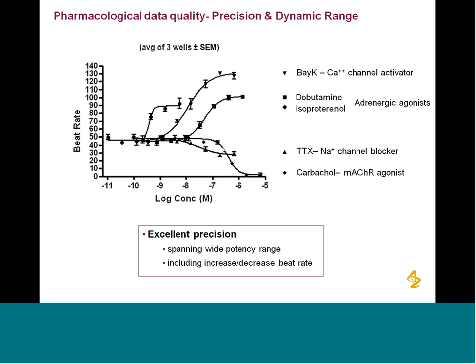Replicate experiments on multiple days. You can, we've published this slide also. You can see that in the publication. I'll come back to variance in a different way in a couple more slides. I do want to pause here and again focus on our experience. Our experience is that in replicate experiments, if the beat rate here is 50, in the following experiment, if it were 60, that wouldn't affect the potency at all.